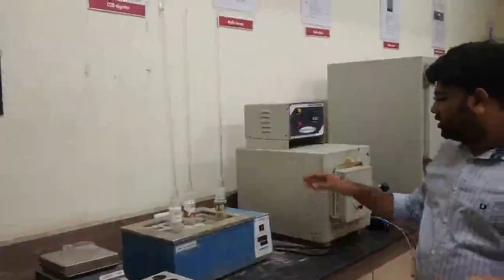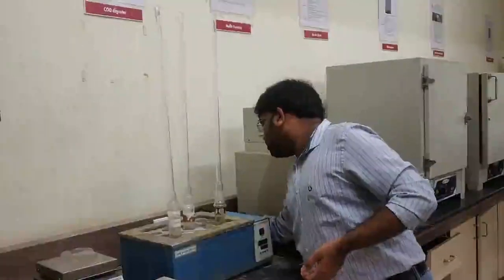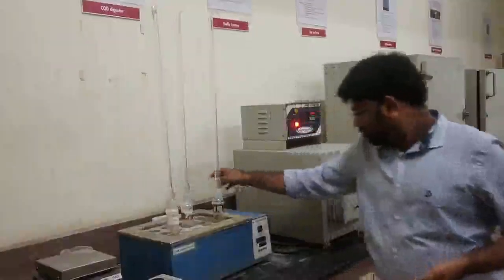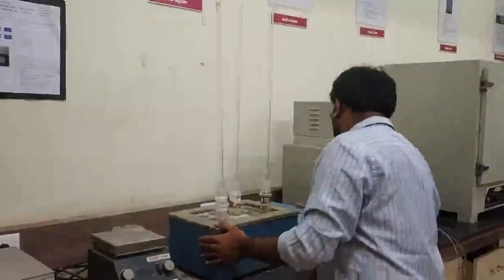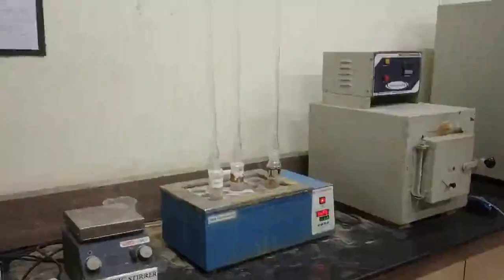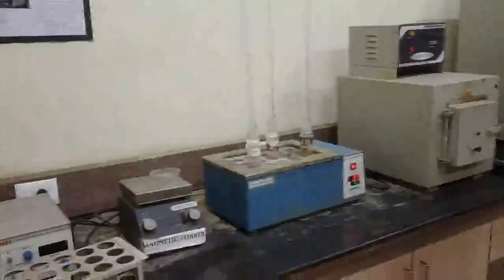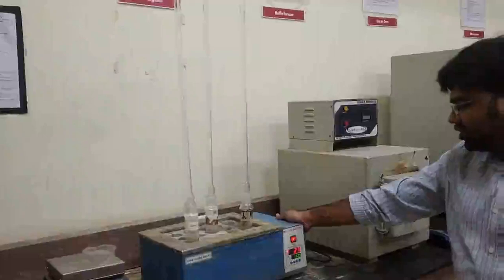So we have attached this. We are going to start the COD digestion flask. So we have started our COD digestion, right?